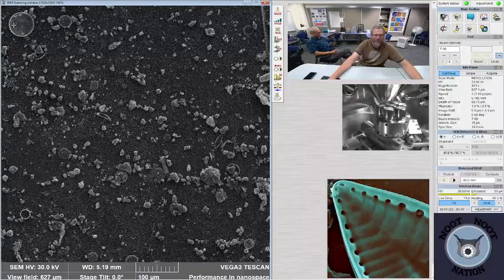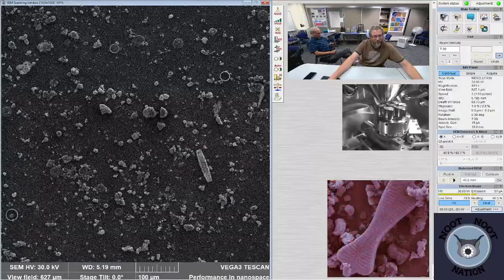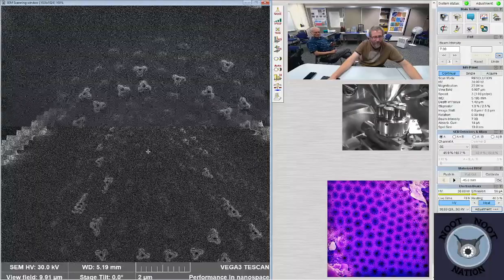Man, that was a cool Gomphonema I found. Okay. Ooh. These things? Yeah. They're all over the place.